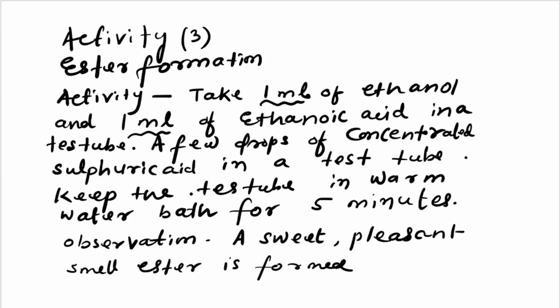A few drops of concentrated sulfuric acid are added in the test tube. Keep the test tube in a warm water bath for 5 minutes. In the water bath, you keep the test tube for 5 minutes. Observation: a sweet, pleasant smell of ester is formed.